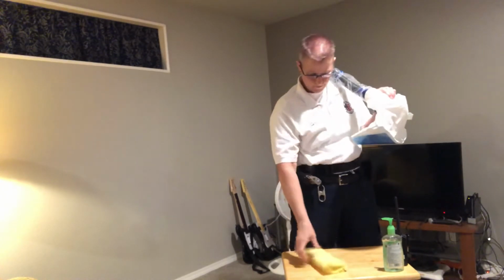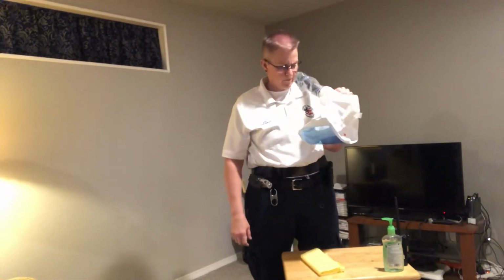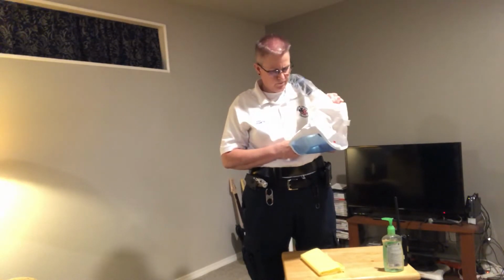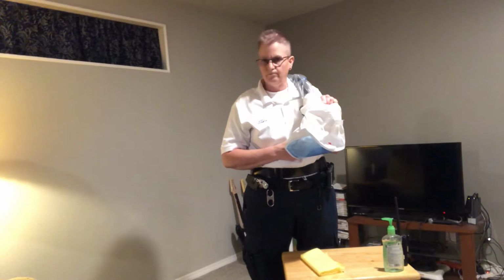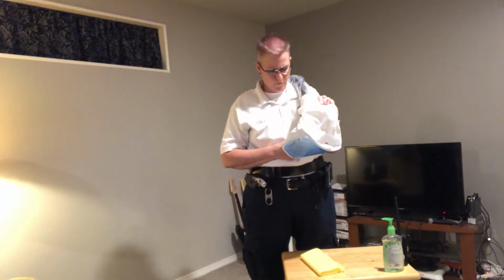okay? It's basically, at this point, checking the airflow, checking the motor, checking the filter. If one of these things is not in place, it will alarm, or if one of these things is not performing properly, it will alarm. The nice thing about the PAPR is it will let you know when something's not correct. One of the small snags is that the filter inside the PAPR unit itself can sometimes misalign, and obviously if it's misaligned, it's not going to filter properly or optimally, and it will let you know if that is the case. So listen to your unit.